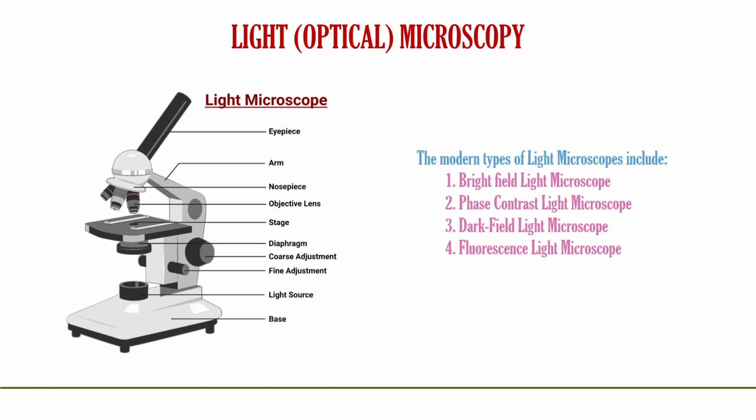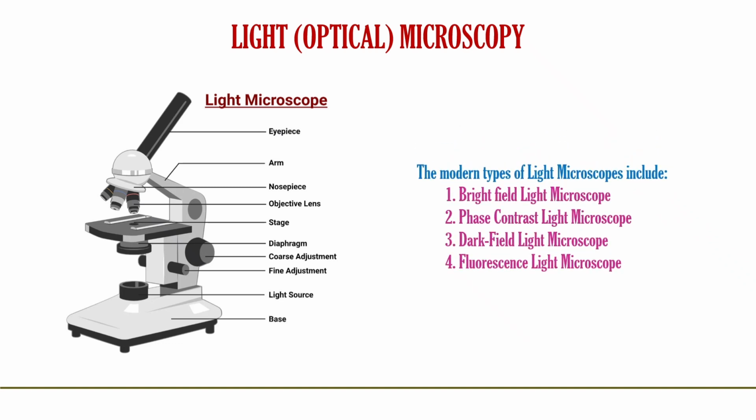The modern types of light microscopes include: 1. Bright field light microscope, 2. Phase contrast light microscope, 3.